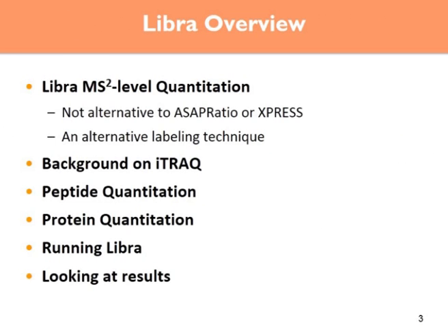So this is the overview. Talk about MS2 level quantification. A little bit of background on iTRAQ, and then how we quantify using the software at the peptide and protein level, and how to run and look at results.